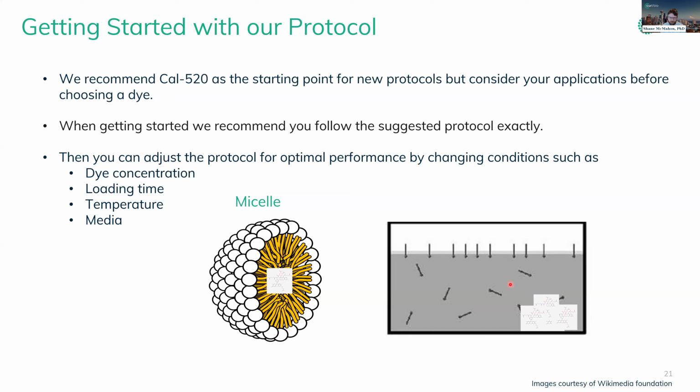So after you have a working protocol adhering as closely as possible to our optimized protocol, then you can adjust the protocol for optimal performance or for convenience by changing factors such as dye concentration, loading time, temperature, and media conditions.